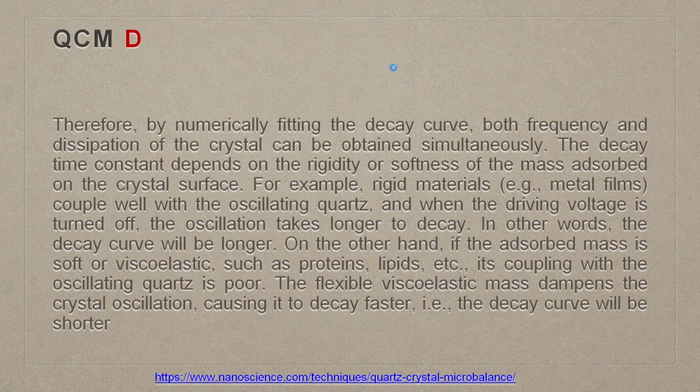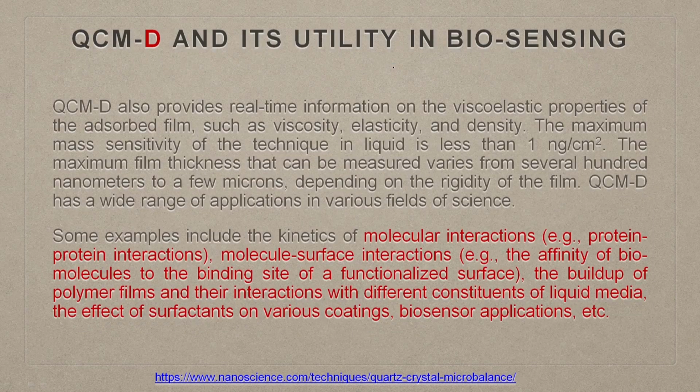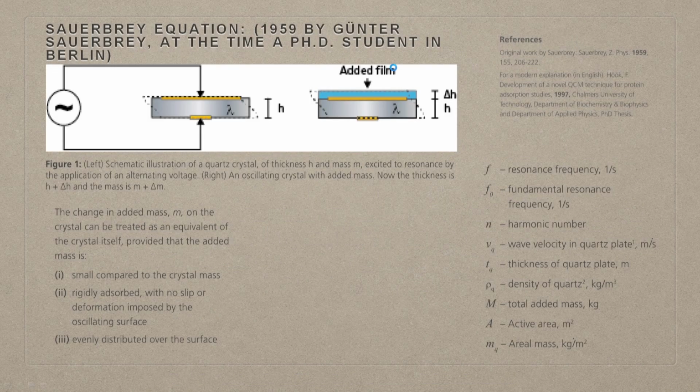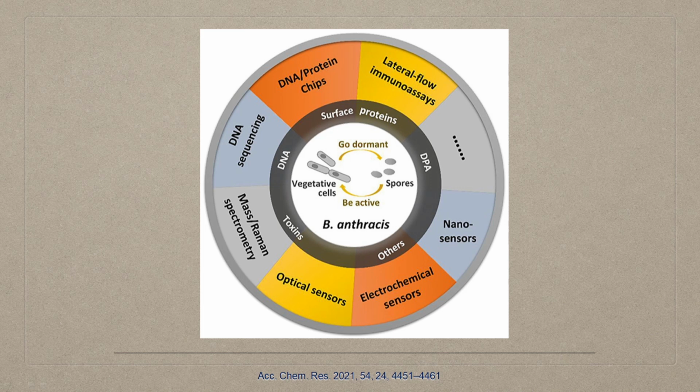So, this is the quartz crystal balance when we did, even before this, impedance analysis, right, to this, sensitivity, theory of piezoelectric crystal, here it is. So, it started out here, and I told you electrochemical sensors, optical sensors, right, and they go hand in hand. Then you have the nanosensors, and of course, mass will be coming soon.